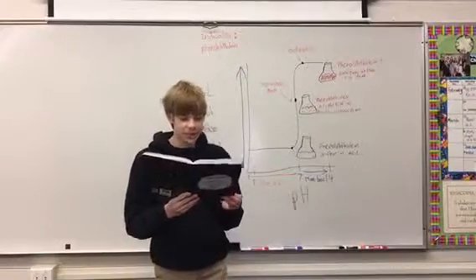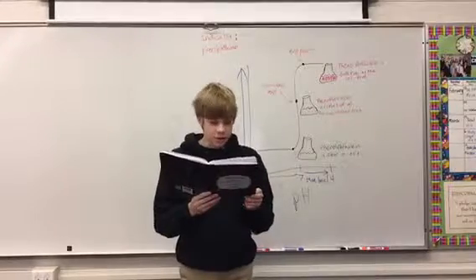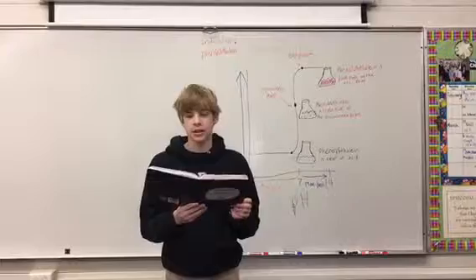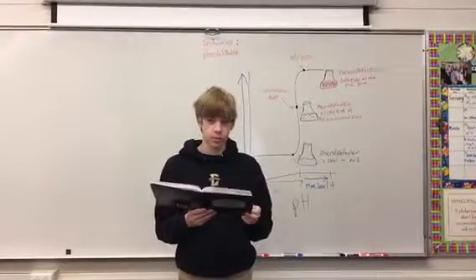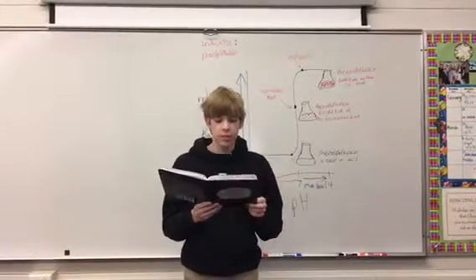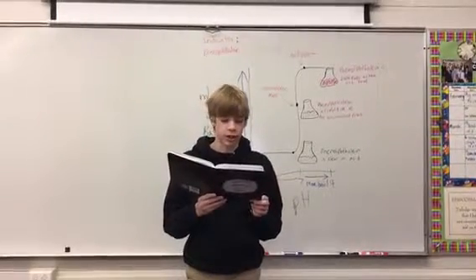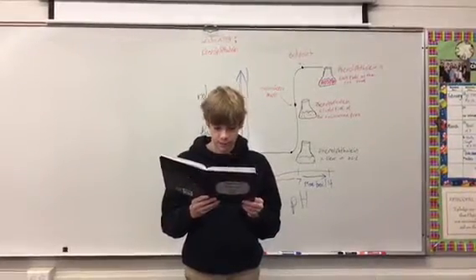Since acids and bases react, the progressive addition of a base with a known concentration to an acid with an unknown concentration, or vice versa, can be used to compare the concentrations in order to determine the chemically equivalent amounts of the acid and base.